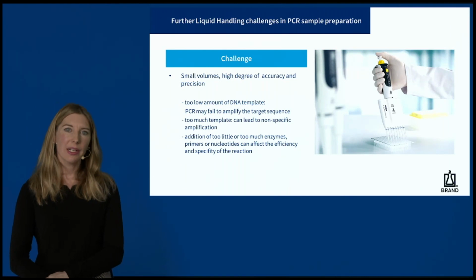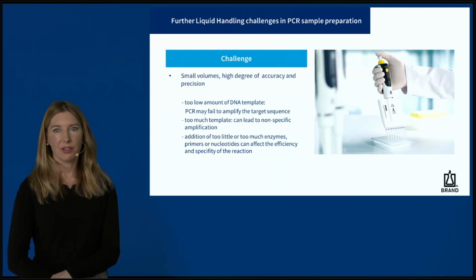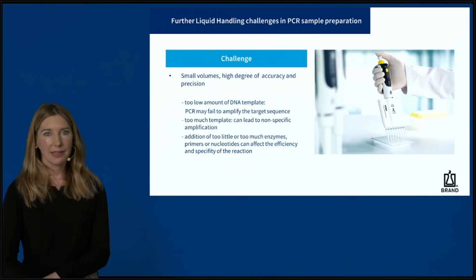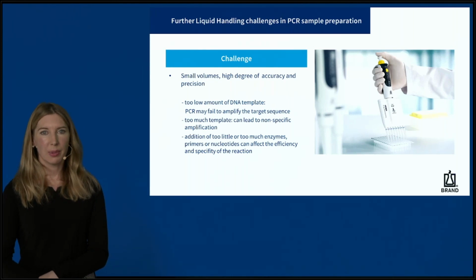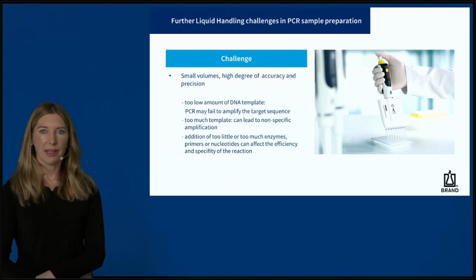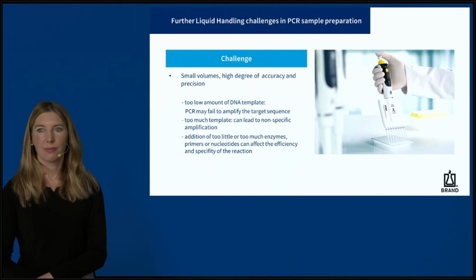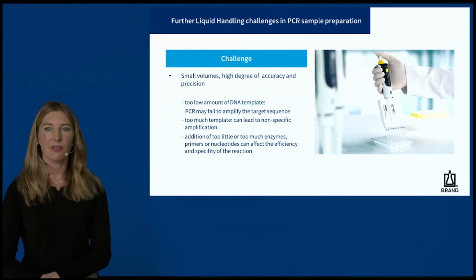The challenge for liquid handling even starts in the extraction of the DNA or RNA from the sample. The next step is the transfer of a very small amount of extracted DNA or RNA with high accuracy and precision for reliable results. The success of PCR depends on the precise amount of reagents that are added to the reaction mixture. A slight variation in the amount of any of the reagents can lead to significant changes in the final results.